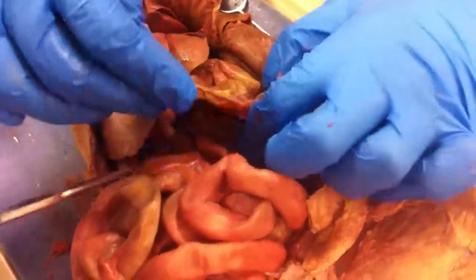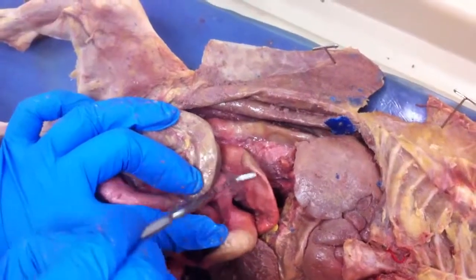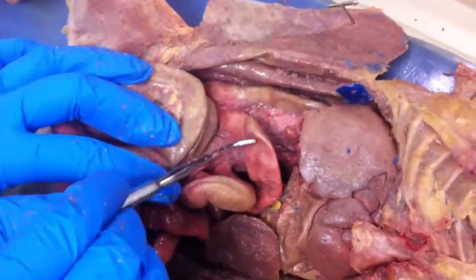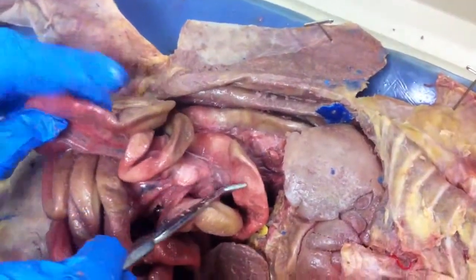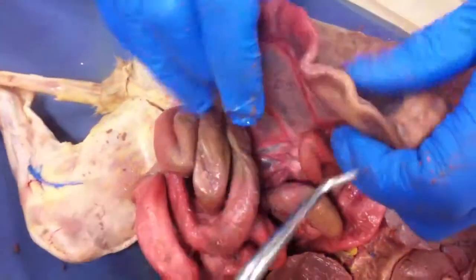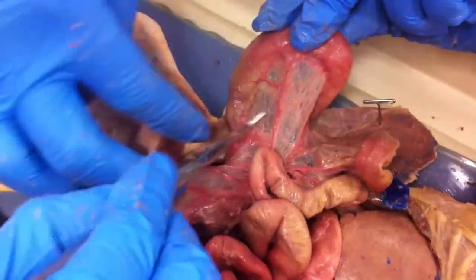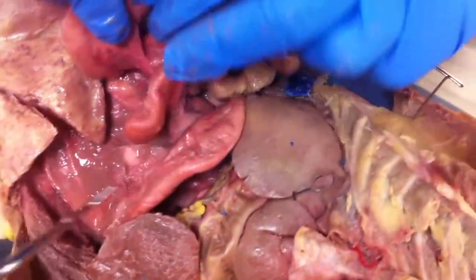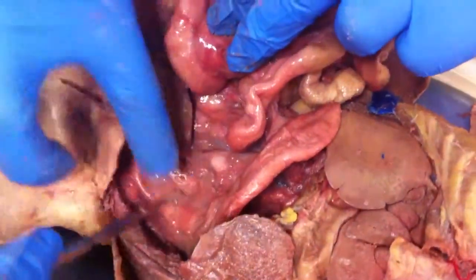Now, if you look below the liver, you see that structure back there? That is the lesser omentum. Now, the cecum is a small finger-like protrusion from a structure on the large intestines. It's coated in bacteria to assist the cat in digestion. You can also use it to differentiate between the large and the small intestines. Now, here we have the small intestine, which is being flared out for you right now, where you can see the blood vessels right along there. And at the other end of the small intestine, you get led to the large intestine, which is this tube here. Ours got punctured, so it's a little flat, but it's still there.